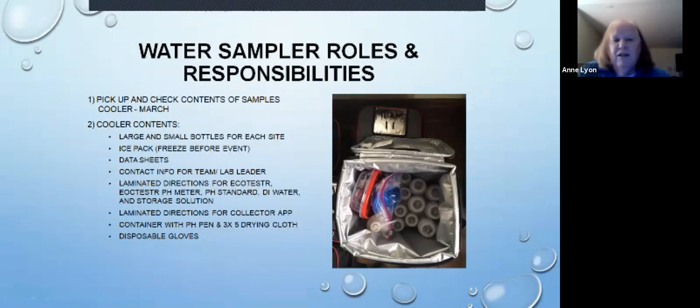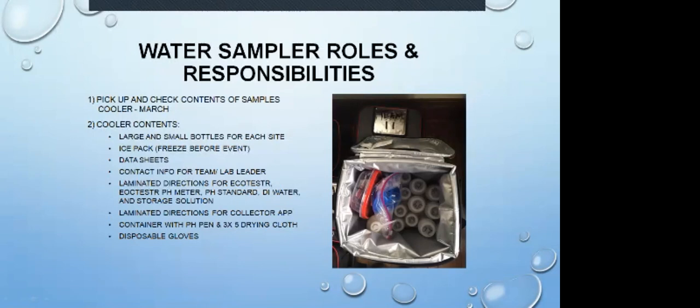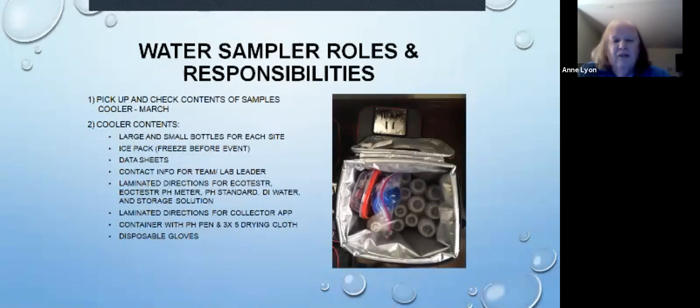You'll have some paper data sheets in there, contact information for your team and the lab leader in case there's some issue, you're going to be late or something's come up that you need to contact us about. It'll have laminated directions for your eco-tester. It'll have your eco-tester pH meter. It'll have the pH standard, which is in a little pouch, some DI water, and we will put a little thing of the storage solution in there, but we're hoping that when you drop off the samples, you'll go ahead and put new cotton in the storage solution right at the table at the drop-off.